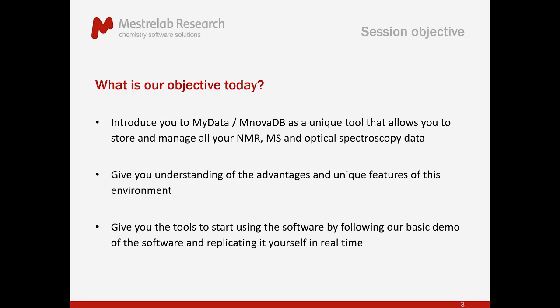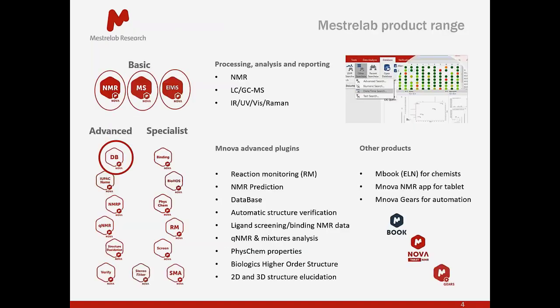So hopefully everybody who is attending the session received an email today with an installer for the software, including MyData, and also with some analytical data, in this case, some Mnova documents, which you should have saved to your disk. And assuming that all that is in place, we can then all follow the same steps in a little bit when I go into the demo.